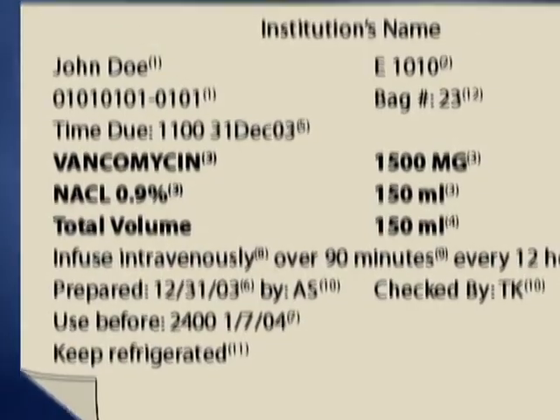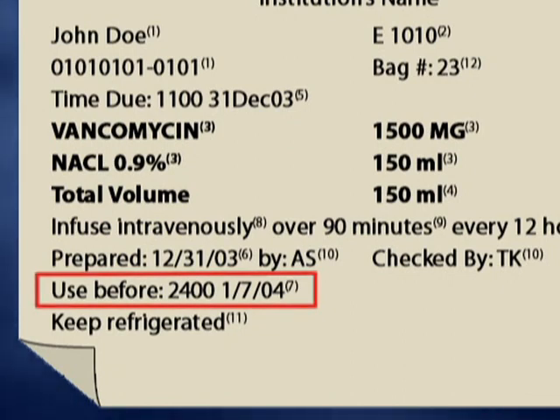For example, the scheduled administration time may indicate when a drug was prepared based on that sterile preparation's batch or fill list period. Section 7 includes beyond use date and time, if applicable. This section is similar to Section 3 on the USP label. Traditionally, in an institutional setting, the expiration or beyond use date assigned to a preparation is the actual time that the medication is considered unusable by the patient.